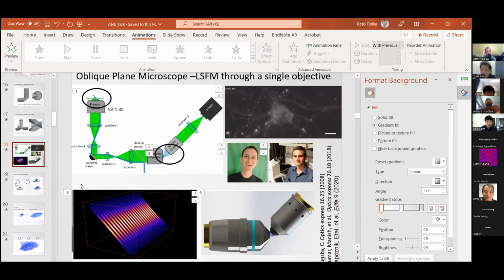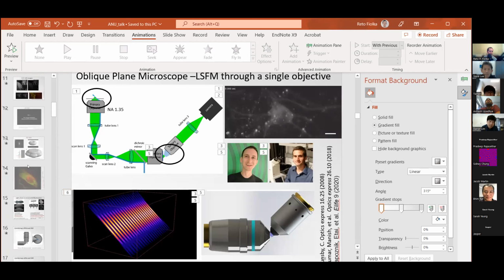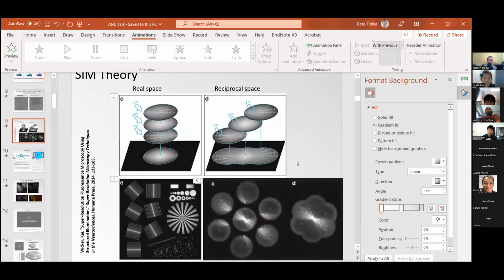Oh, with views, you mean orientations? Yeah, orientations. To some degree, I think you could gain uniformity. It will probably be a similar argument here. This passband, sure, in the OPM SIM it's 3-dimensional, but say a cross section through it would still look a little bit like this, and it does so in our extraction. So if you add additional ones, you could probably fill in that space, but I don't think it would be fundamentally smoother, or higher in resolution. I think 3 is quite good.